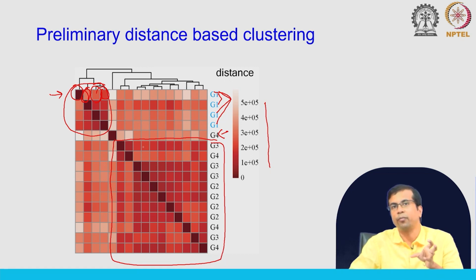All right, so you probably understand now that it gives us an insight. We have 2 clusters, and it would be interesting to compare G1 versus the rest. G2 versus G4 differential expression or G2 versus G3 will probably not give you interesting results, because they are very similar in terms of expression profile. So G1 versus rest would probably be the most interesting differential expression analysis that we can do. This kind of insight we can get when we are using clustering approaches.